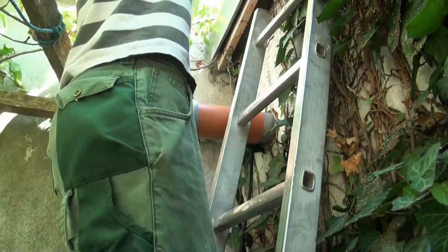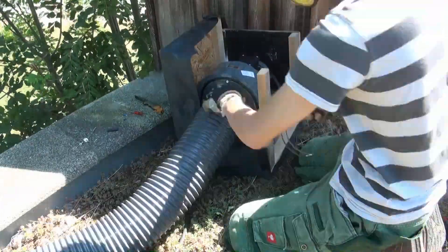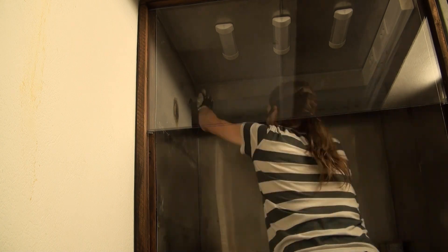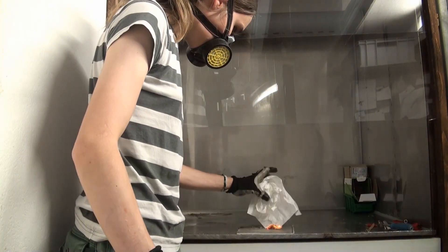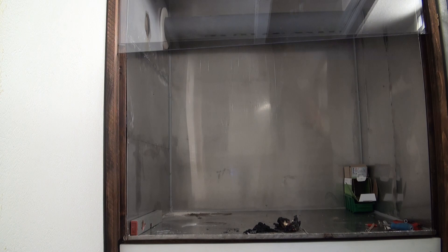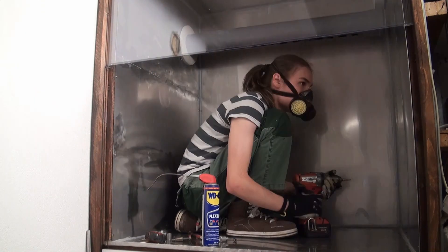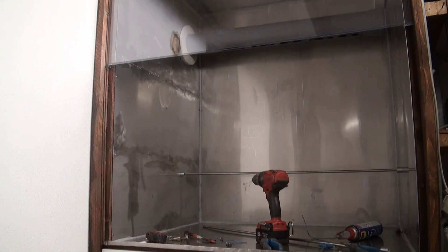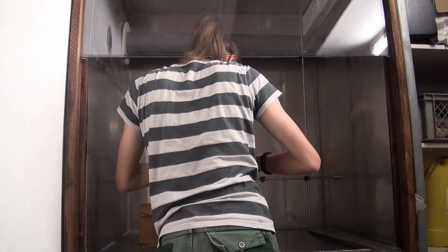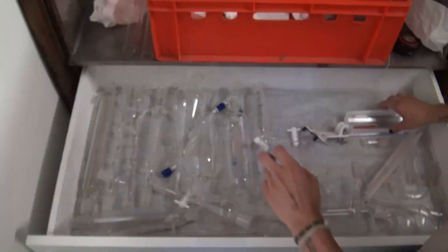An important thing to take care of was the suction that even makes the fume hood work. This consisted of routing air pipes onto the roof of my lab and then putting the motor on it, in a little box of course in order to protect it from the elements. After this the fume hood was crudely tested by burning stuff inside. The last and also very important part was installing the rack into the fume hood. And after adding all of the stuff back I was able to call it complete — mostly.